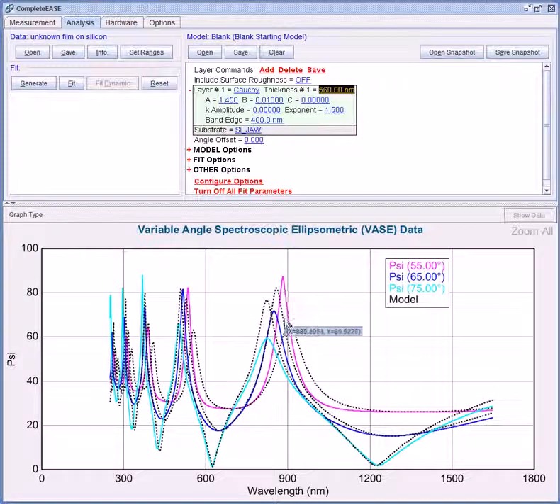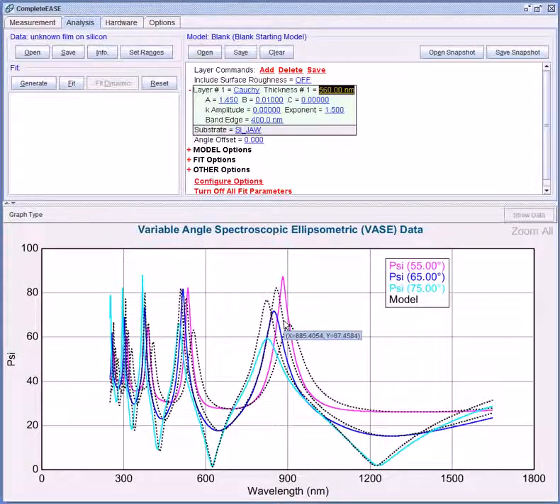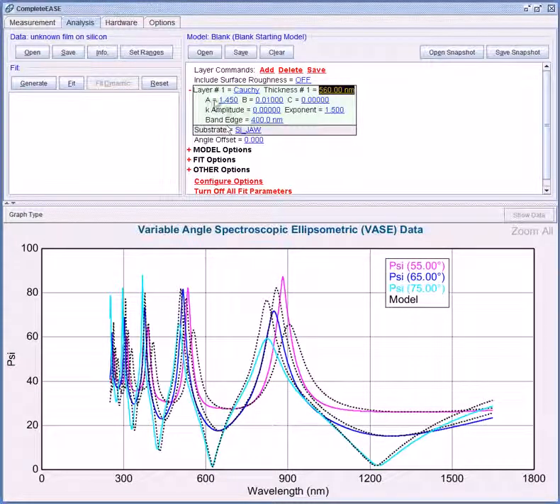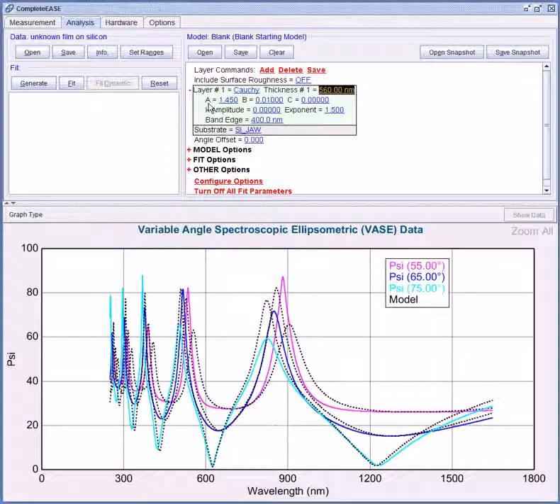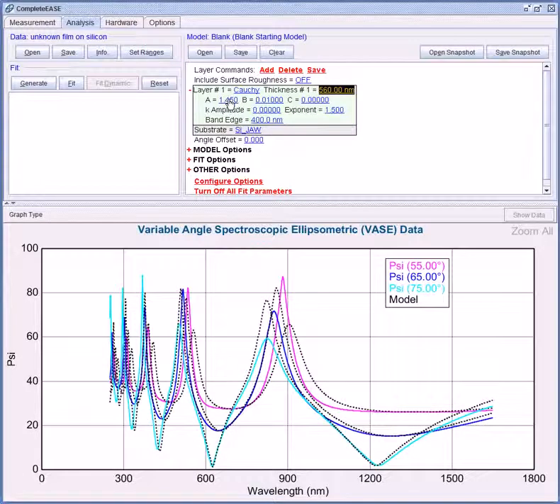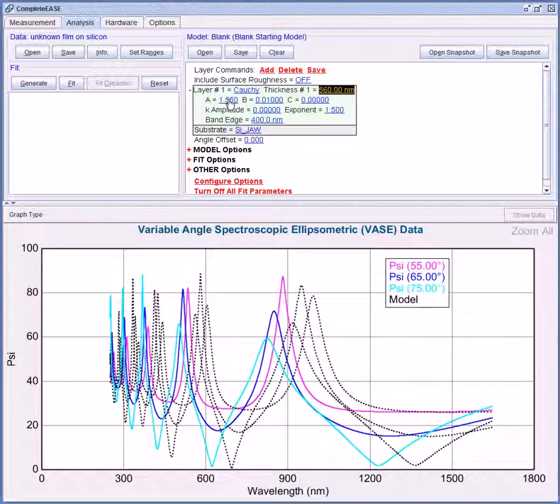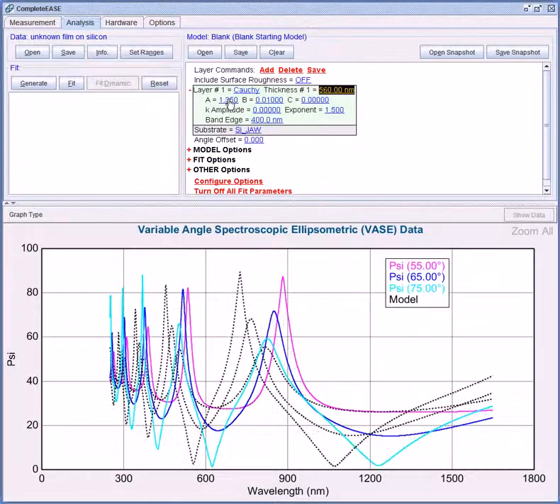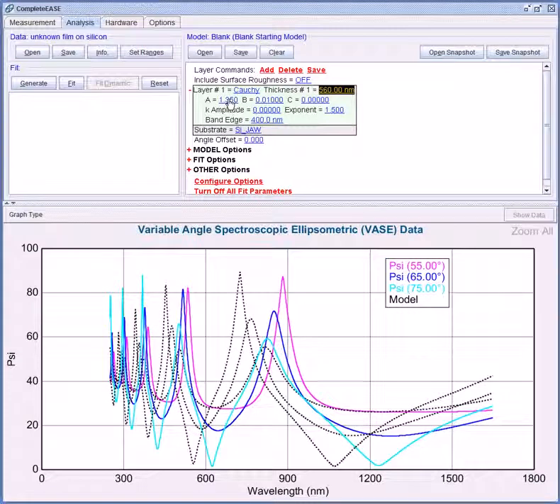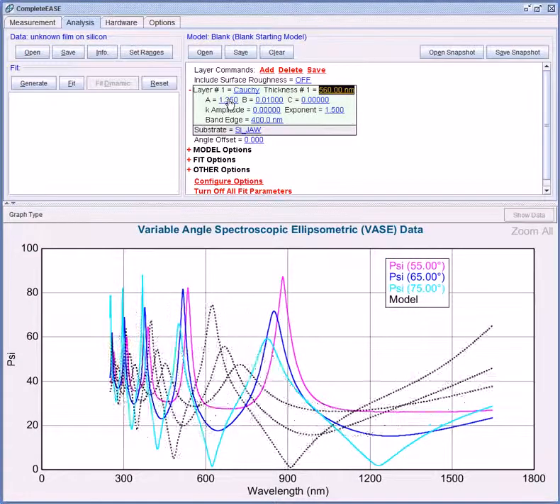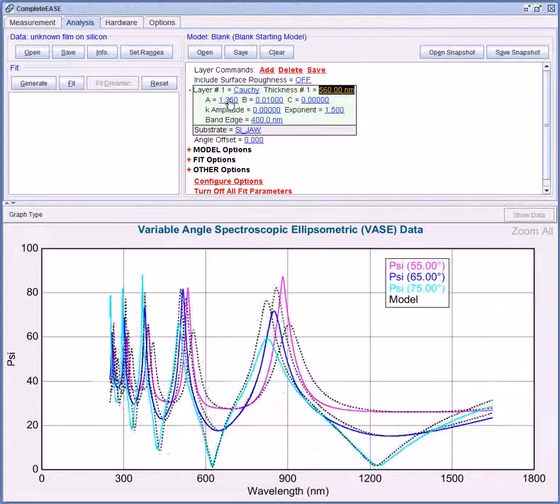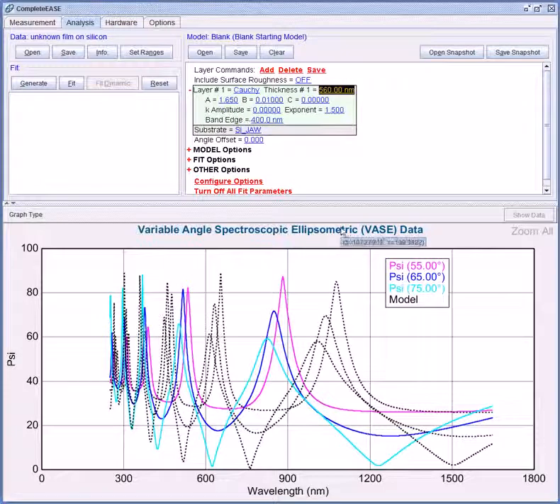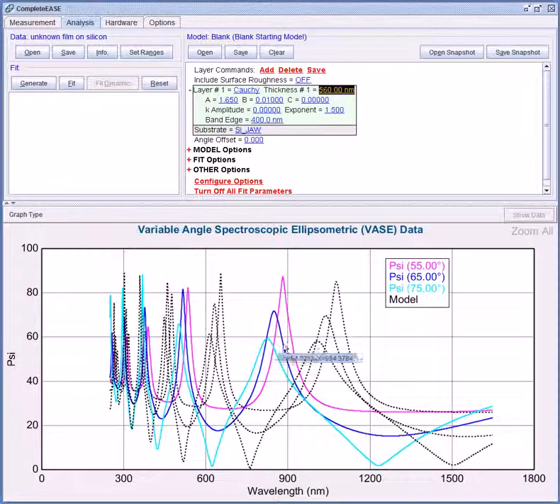The peaks are still off and this is related to the index difference between the experimental data and my model guess here. The Cauchy coefficient A is approximately equal to index at long wavelengths. Again if I hold my mouse over this value and press the shift key I can scroll up or down to adjust this value. And you'll see the peak heights and the model generated data adjust accordingly. Somewhere around A equals 1.65 looks like the peak heights are a much better match.